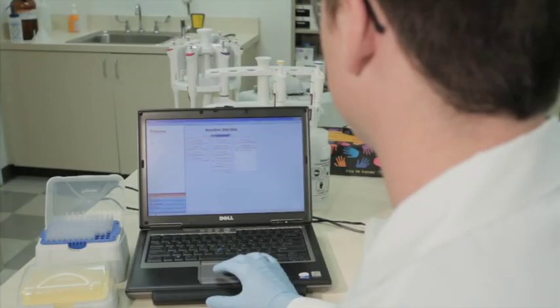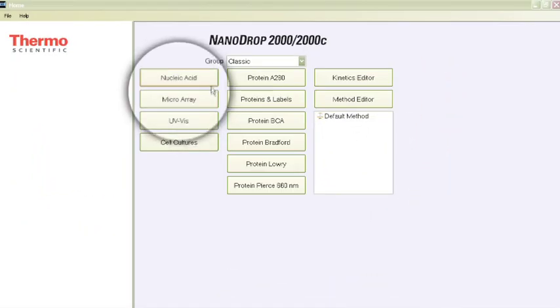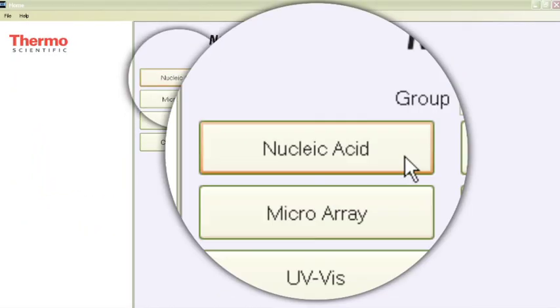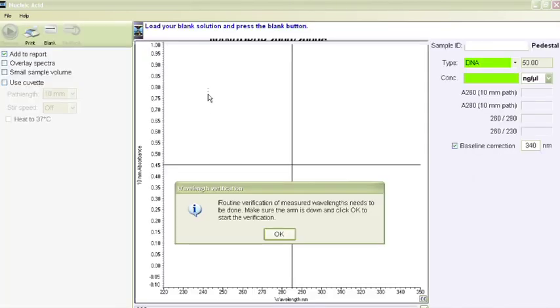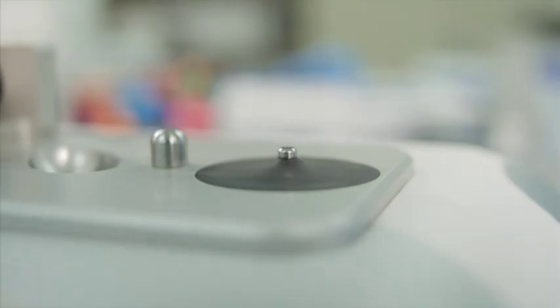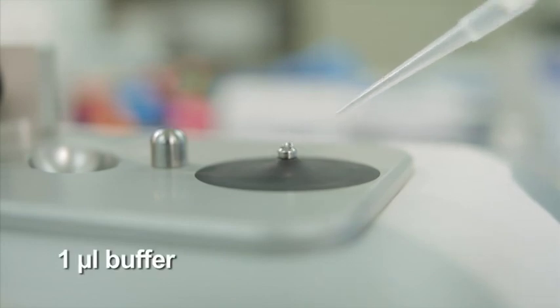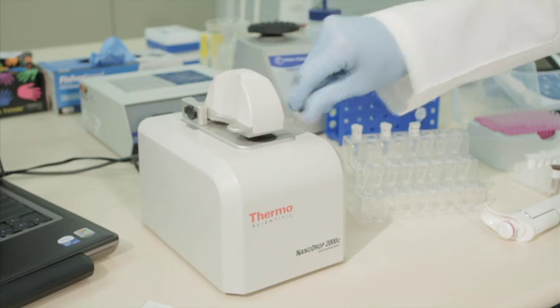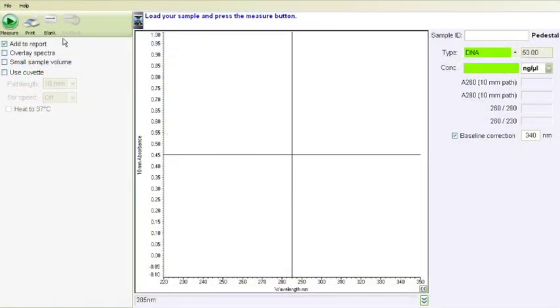Next, open the Nanodrop software and select the nucleic acid application. Use a small volume calibrated pipetter to perform a blank measurement by dispensing 1 microliter of buffer onto the lower optical surface. Lower the lever arm and select blank in the nucleic acid application.